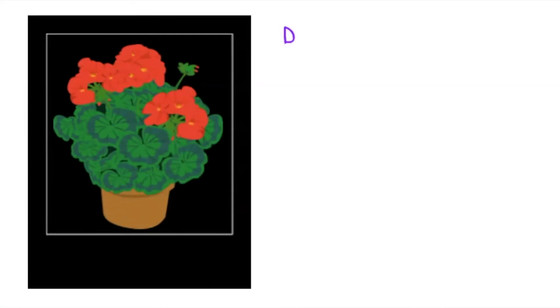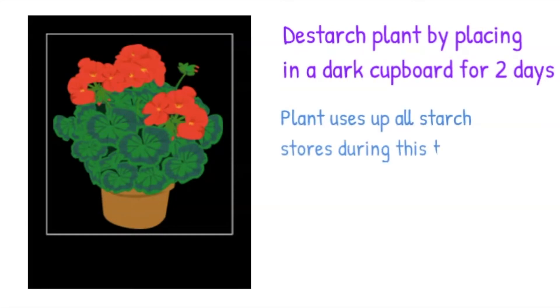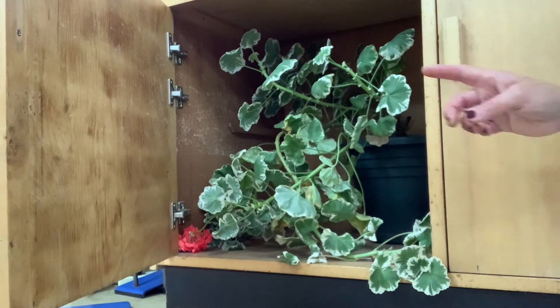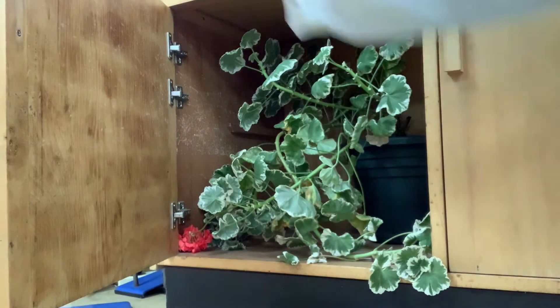First of all I need to destarch a plant to make sure it has used up all its stores of starch, so that I know any starch I detect in the leaf is from photosynthesis. To do this I left a healthy plant — here I am using a geranium — and put it in a dark cupboard for two days.